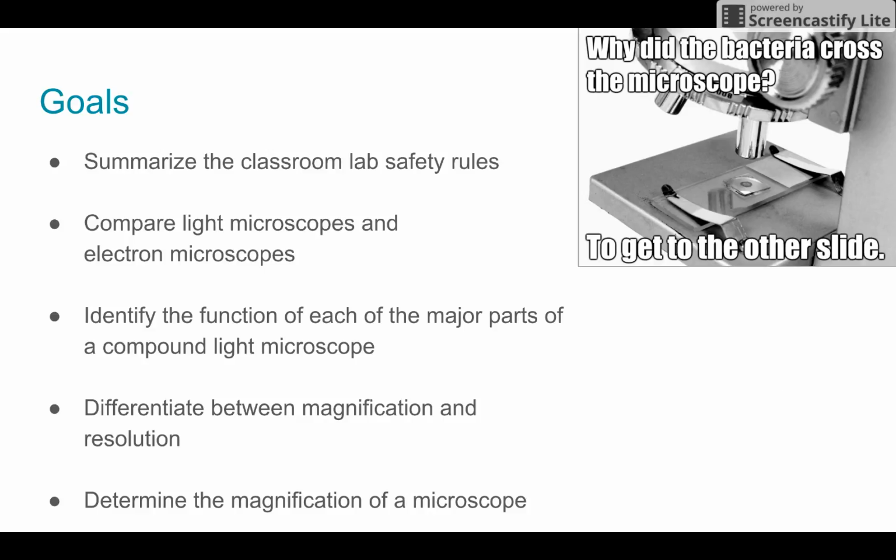Summarize the classroom lab safety rules, compare light microscopes and electron microscopes, identify the function of each of the major parts of a compound light microscope, differentiate between magnification and resolution, and determine the magnification of a microscope.